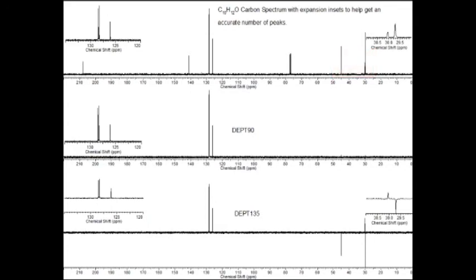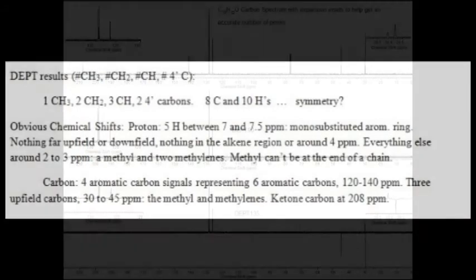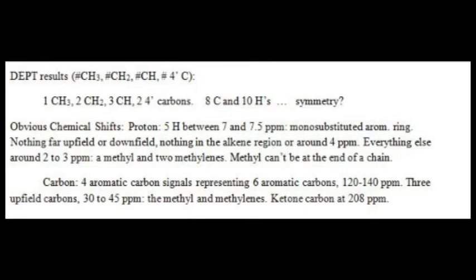Finally, there is the other quaternary carbon, this one down around 210 ppm. This one, let's face it, is practically screaming ketone at us. We now have more of the template filled in. We've now filled in the chemical shift portion.